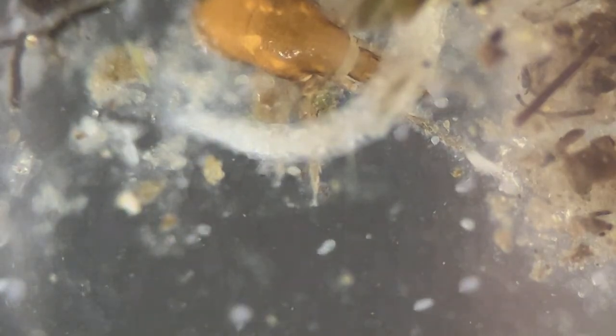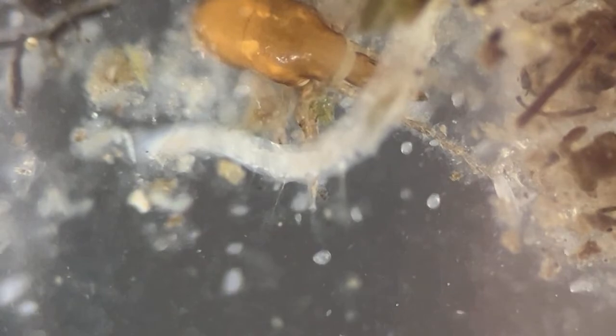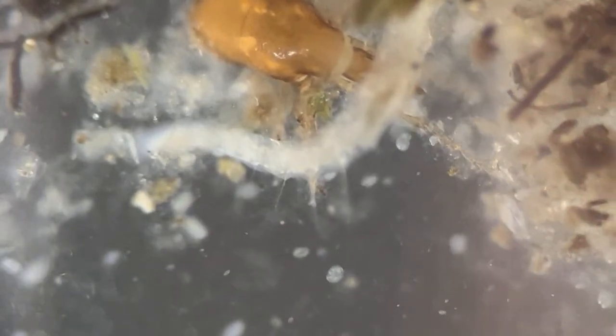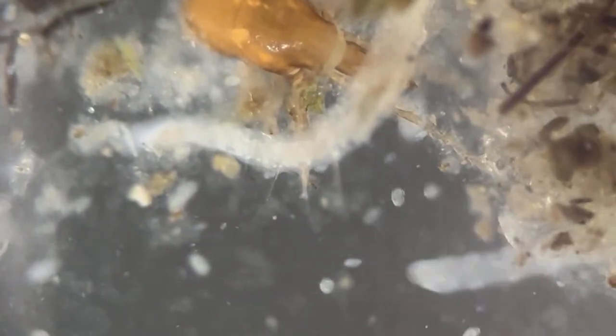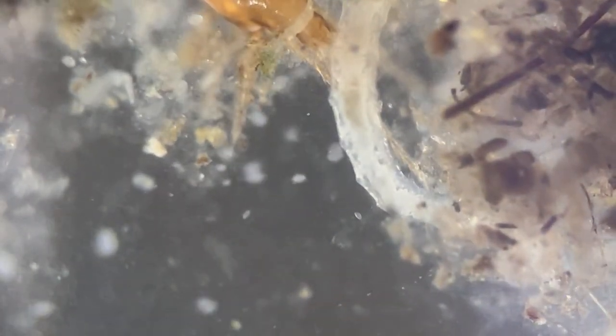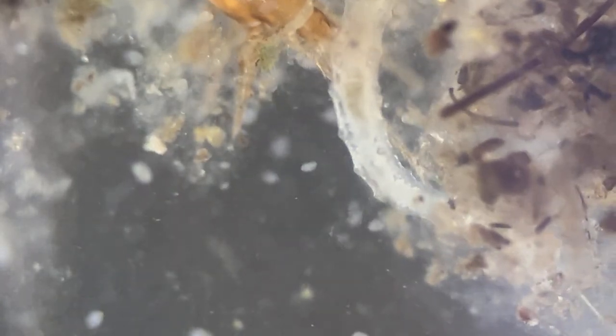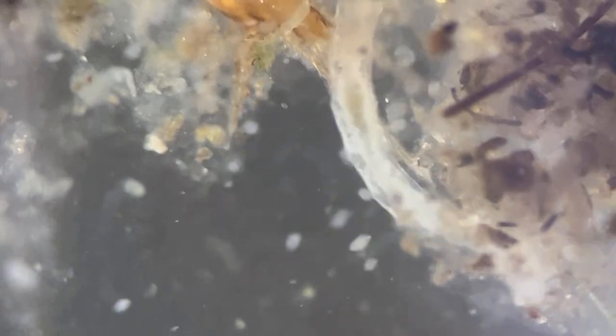Yes, folks, I'm back with a small cover to wrap on this little eyepiece so as to prevent the reflection. And I hope it will work. It should. All right. I've also got my little mic to connect.